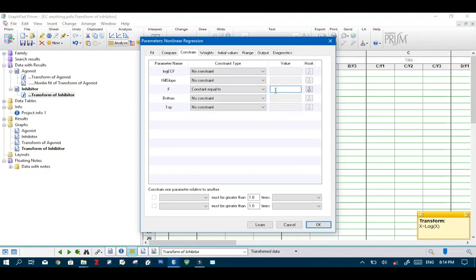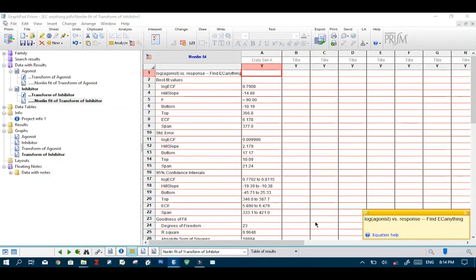So then now for this example we want to find let's say IC 90. So we'll enter 90.